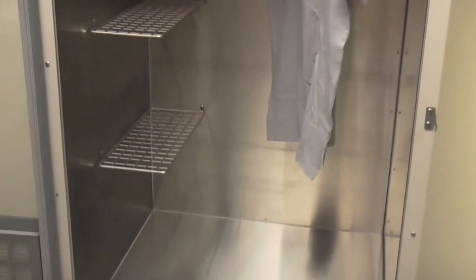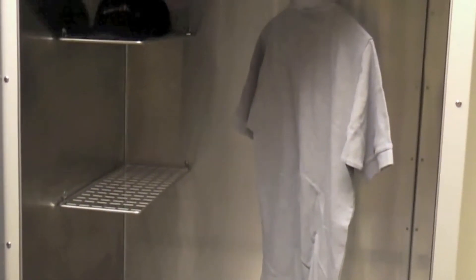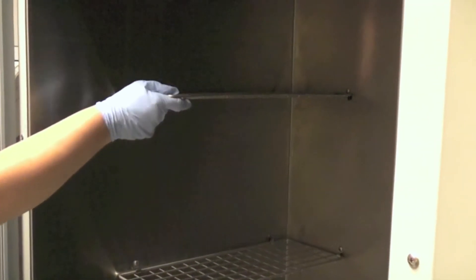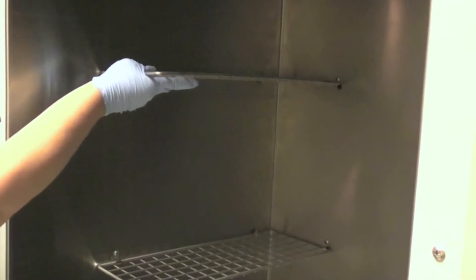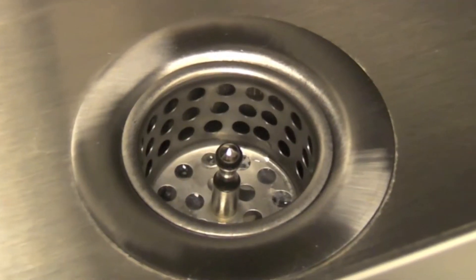The spacious interior includes a stainless steel rod for hanging evidence and three stainless steel wire mesh shelves that can easily be collapsed or removed. The interior floor of the cabinet is sloped to a two-inch drain that includes a strainer.